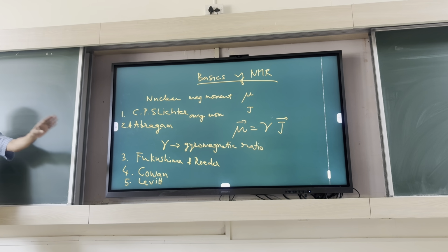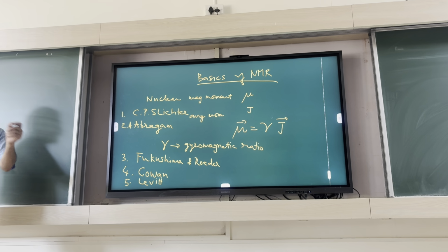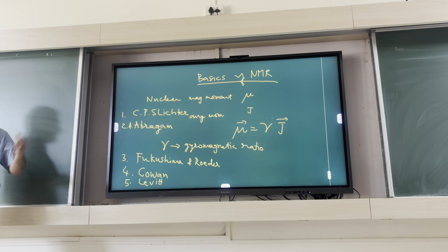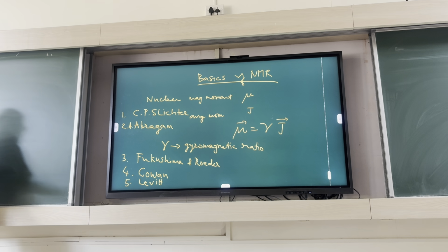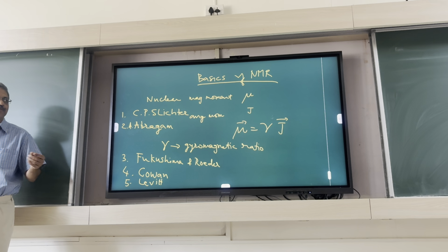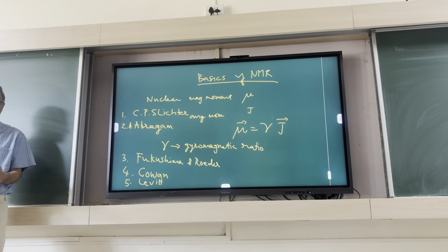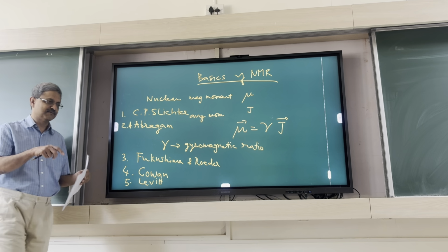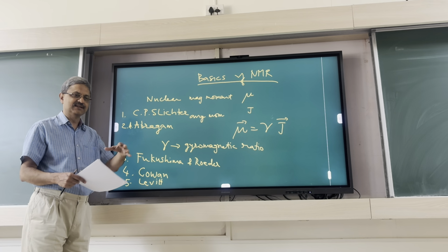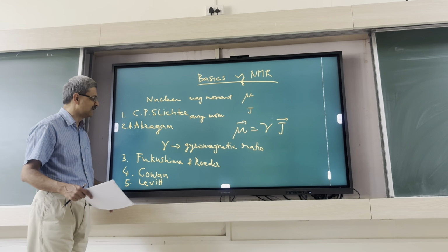You don't need to read the full book for getting an insight. One has to focus on some specific chapters. With NMR, you generally learn that chemists use it. Not very often do you see physicists trying to use it. Chemists and biologists use it. Chemists basically use it to look at what the local environment is, how it changes in different organic compounds, inorganic compounds, and so on. I'll talk about that at some point.